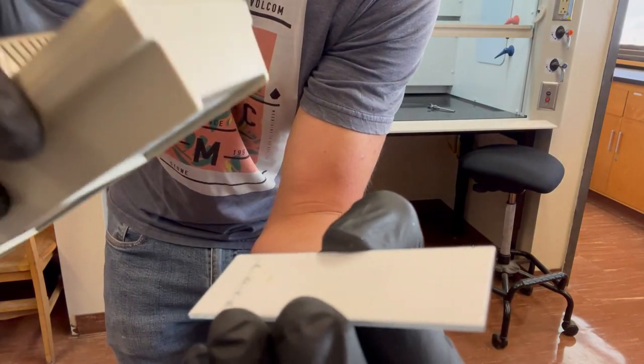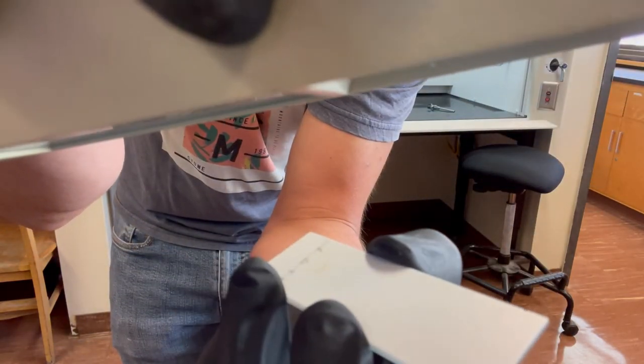Goodness, you can see... oh, it's kind of reversed, I think. Really, this side right here represents the products, and the other side where you see the blue glowing is the filtrate, I'm sorry. And then let's go ahead and switch to shortwave. You can definitely see them a lot better.